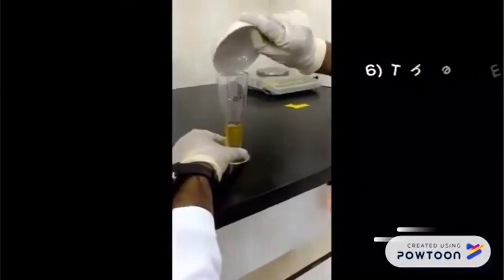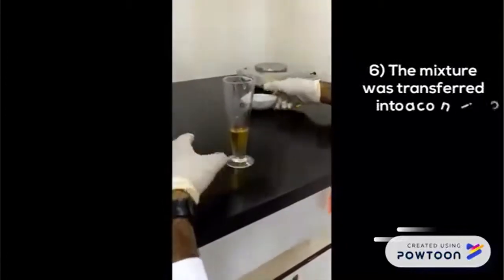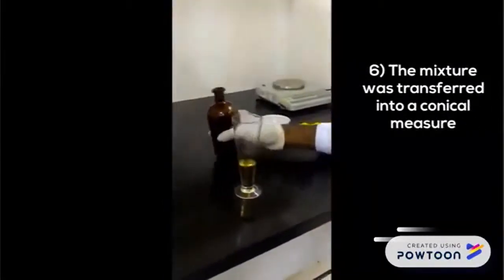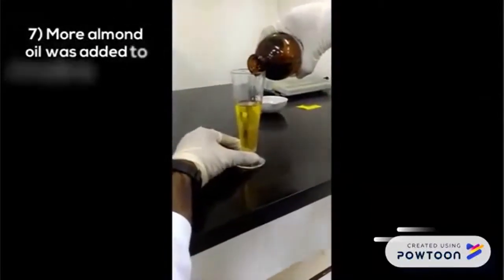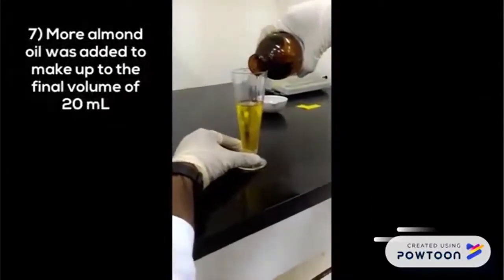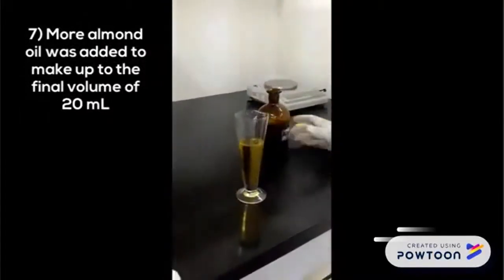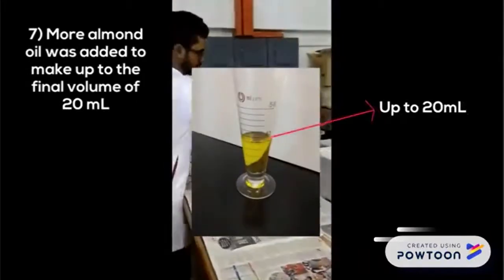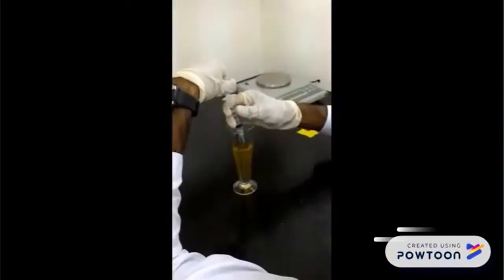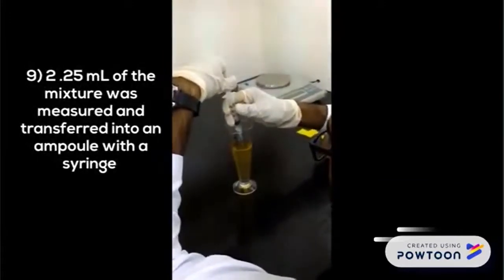The mixture was transferred into a conical measure. More almond oil was added to make up to the final volume of 20 ml. Then, 2.25 ml of the mixture was measured and transferred into an ampoule using a syringe.